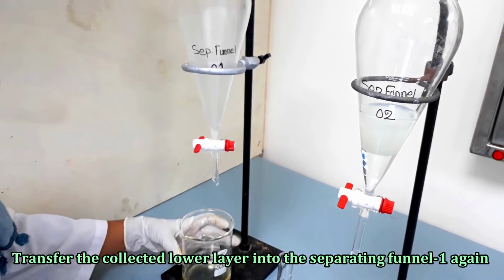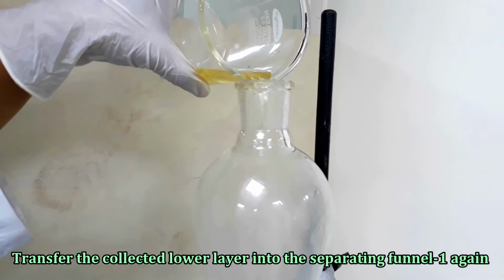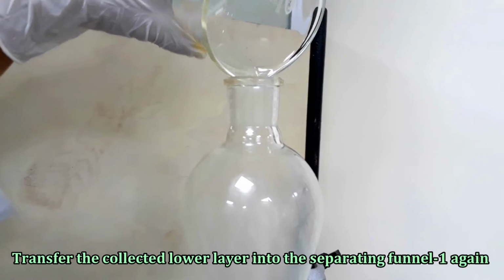Now take the collected lower layer into the separating funnel 1 again and carry out the extraction using water and n-hexane as done previously.